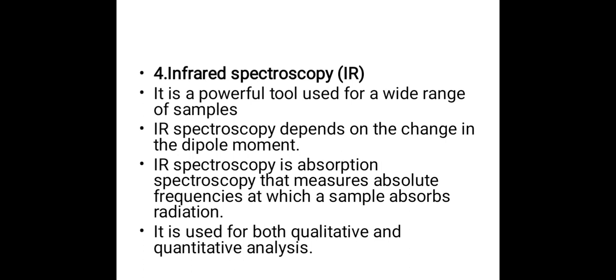Infrared spectroscopy. It is a powerful tool used for a variety of samples. IR spectroscopy depends on the change in dipole moment. IR spectroscopy is absorption spectroscopy that measures absolute frequencies at which a sample absorbs radiation. And what is a major point related to it? It depends on the change in dipole moment. Infrared spectroscopy is dependent on the change in dipole moment.